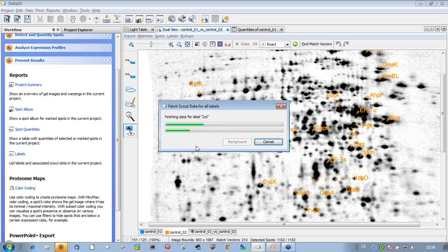This takes a second. And again, let me stress that these queries are automated and you won't miss a single letter, for example, of protein sequences, which can easily happen if you copy and paste this manually from your web browser to the spreadsheet calculation software. So we not only want to save your time, we also want to reduce the sources of possible errors. Of course, the queries take a second. We, of course, depend upon the speed of UniProt here and the internet connection, of course.